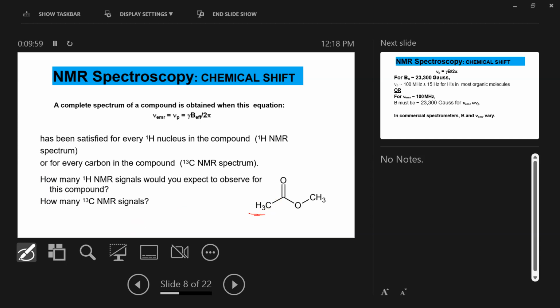All right. Maybe I need to be a bit more specific. What is it close to? What is adjacent to it? What's nearby? A carbonyl, right? Does a carbonyl tend to be electron donating or electron withdrawing? All right, cool. Do you see any protons near it? It's just by itself, right? Okay. What about this proton here? What is it adjacent to?